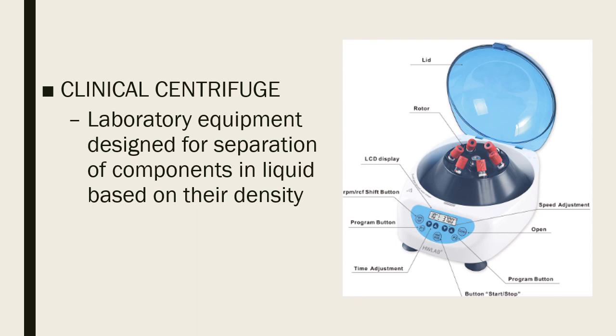Your clinical centrifuge is a laboratory equipment designed for separation of components in liquid based on their density. And so probably you have a solution, but then you're trying to separate the components of that based on their density. And so you have here an illustration of a centrifuge, with the essential parts.